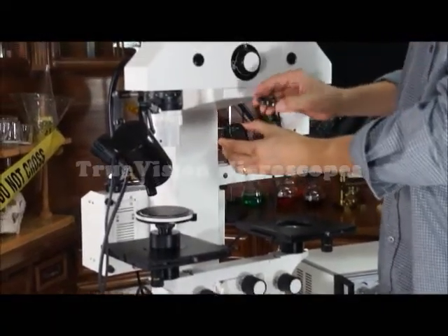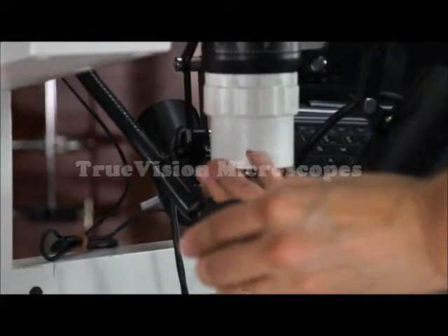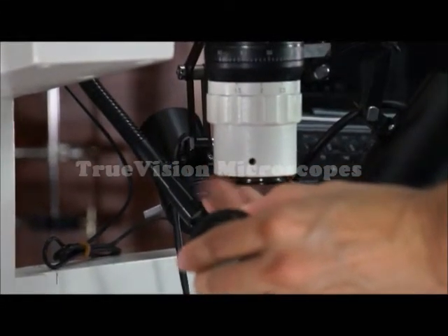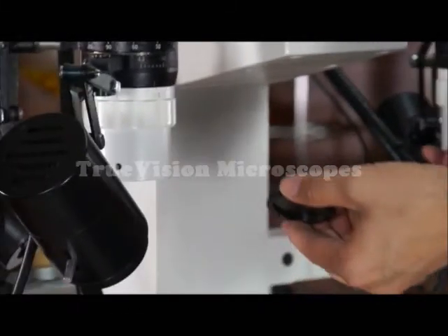I also have polarizing filters. These polarizing filters are screwed to the bottom of the objective. They polarize the light. Plane polarization.